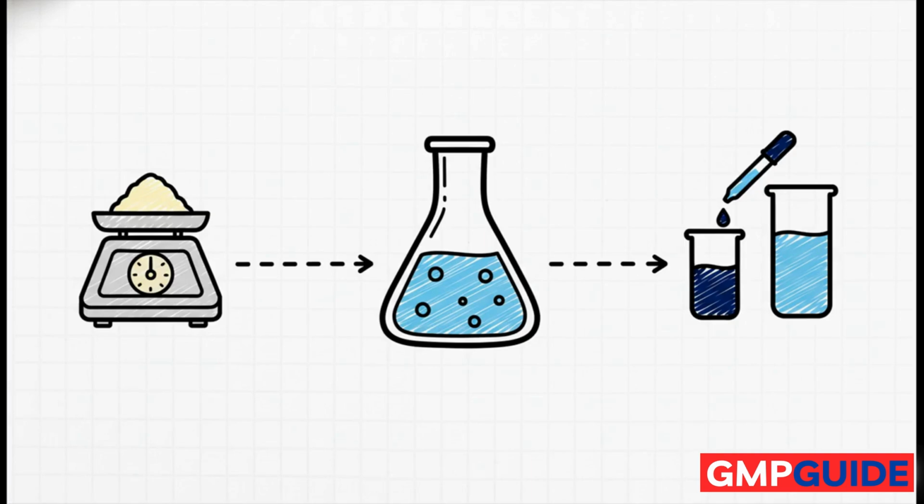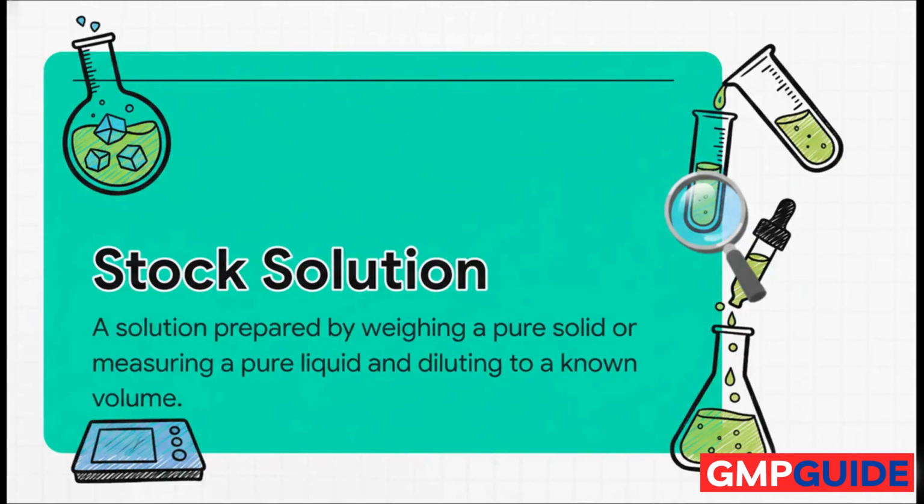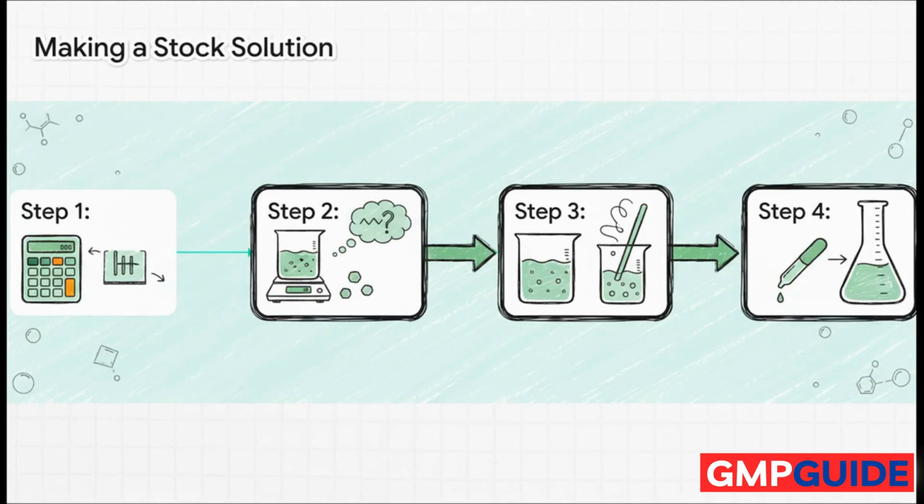There are two main ways to make that perfect solution. You can either make a stock solution from a pure substance or just dilute a stronger one. Okay, first up, making a solution from scratch. We call this a stock solution. It's a simple four-step process. Calculate, weigh, dissolve, and dilute.